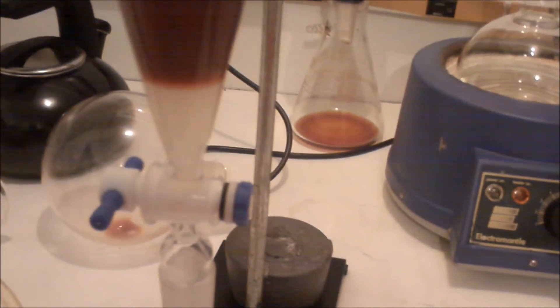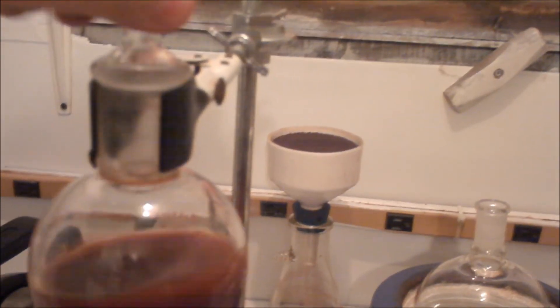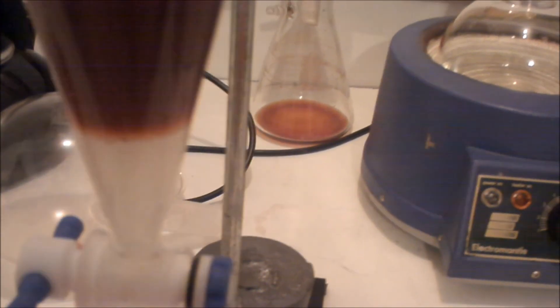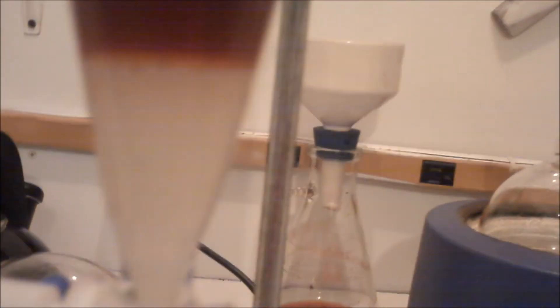Sorry, I almost forgot to record this part. I just added a little — maybe 15 milliliters of dichloromethane — measuring it out, and I pour it into my separatory funnel. As you can see, the dichloromethane, when it first goes in, it's clear, but it's turning this almost milky, a thin milky color. That's because the caffeine is dissolving or sort of transferring into it.